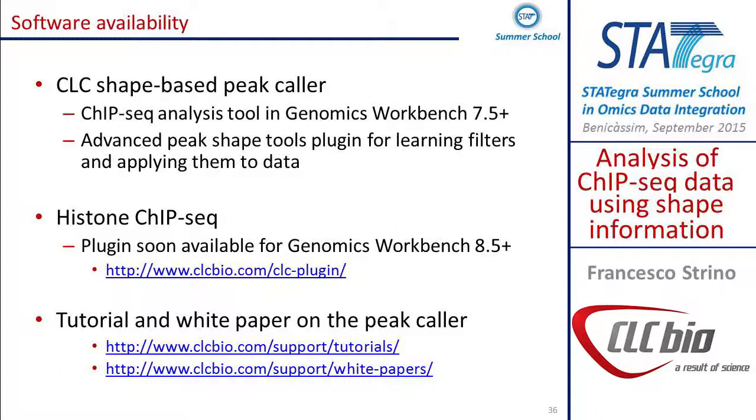And the thing I talked about on ChIP-seq will be soon available in the next version of Genomics Workbench, which is coming next week or the week after that, I think. And in case you're interested, there are tutorials and white papers on the peak caller.